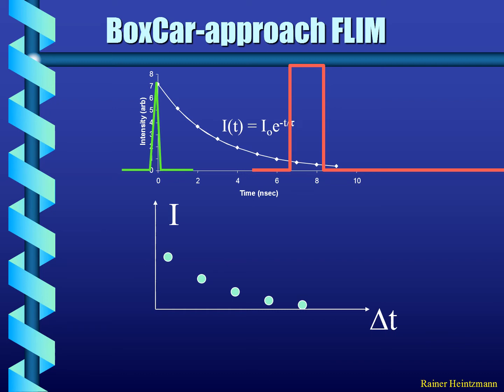So you might wonder now, is this curve really what we want? And it turns out in most respects, it's the same as what you want to measure, even though you're convolving. However, there are some differences, and I'm going to show you this in the next slide.